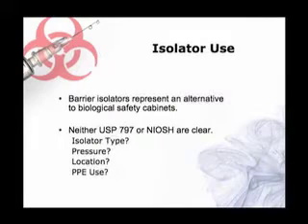There's compounding isolators, there's aseptic isolators, there's compounding aseptic isolators, there's positive pressure isolators, there's negative pressure isolators, there's turbulent flow isolators, there's unidirectional flow isolators, and then where do you put them if you buy one? Do you have to put it in the clean room? Or can you just drop it out in a hallway, since it's all self-contained? And that's what a lot of people were actually doing. They were taking the isolators and they were just putting them in a separate room, not necessarily their clean room. And because the isolator was all self-contained, in the first iteration of USP, it actually met the standards.